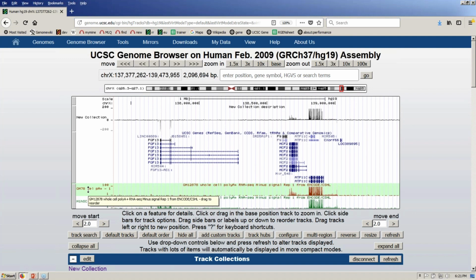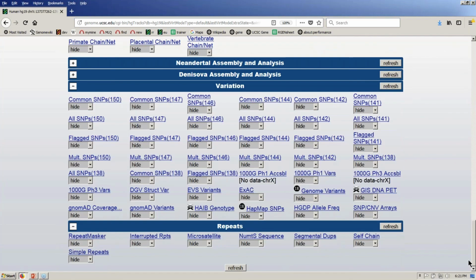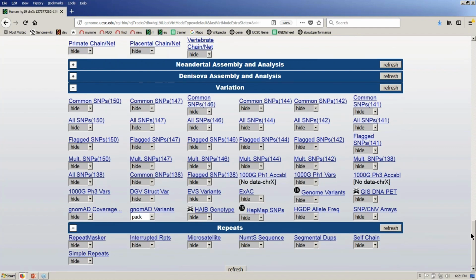Thank you. Another question here is, can you quickly show us the Genome-AD and refseq tracks data integration? I'm sorry, what did you say? Oh, Nomad. Yes, I'm sorry. Nomad, okay. Pronunciation. Yeah, we like to pronounce it that way because that's actually a word, right? A nomad. It's not spelled that way. But, okay, yeah, so let's turn on Nomad to pack. I think I did show that yesterday. And what was the other one? refseq? refseq, yes. Okay, sure.